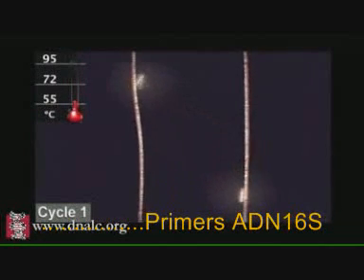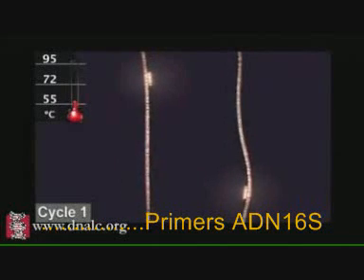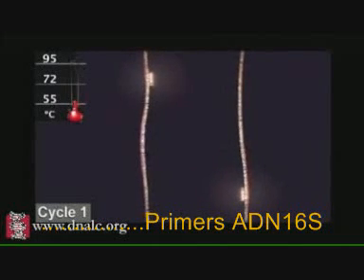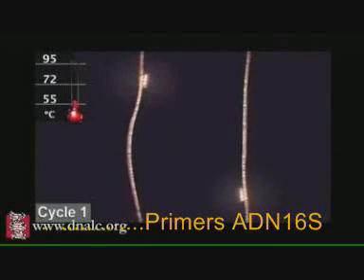When the temperature is decreased, short DNA sequences known as primers bind or anneal to complementary matches on the target DNA sequence. The primers bracket the target sequence to be copied.